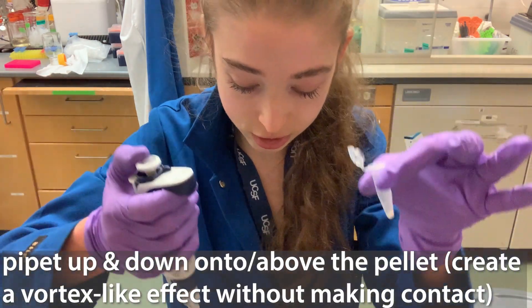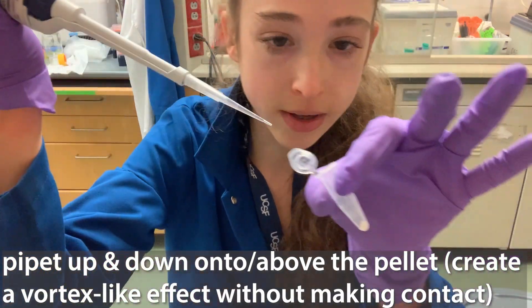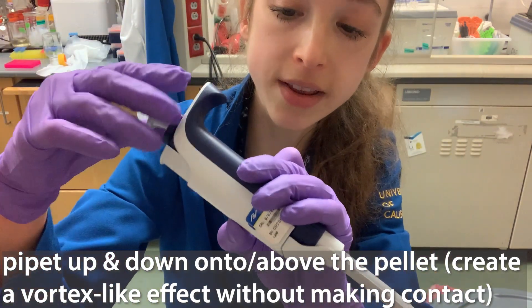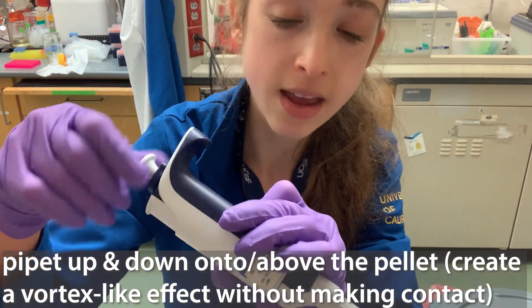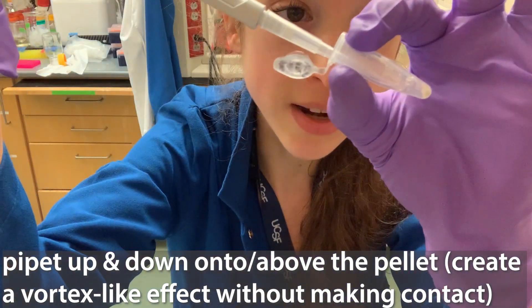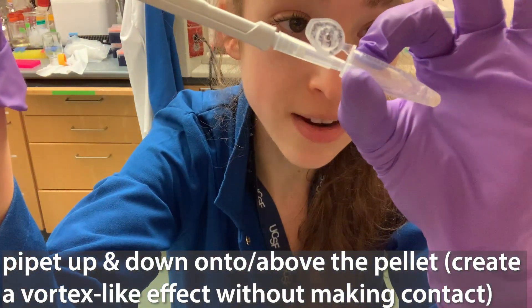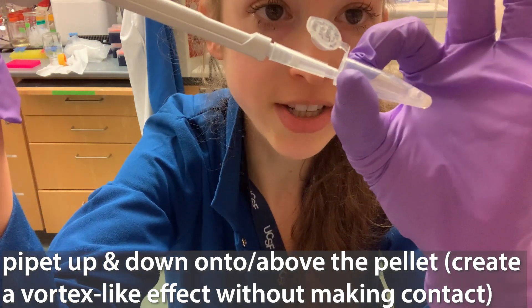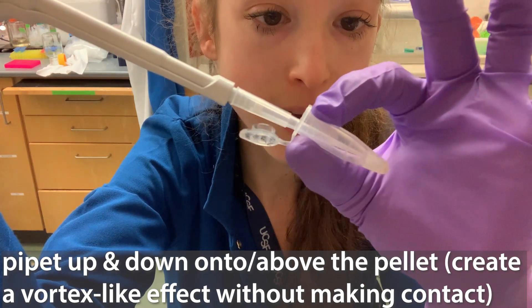Say you have a pellet in a tube. You add the liquid, the amount that you want. Now I'm going to set my pipette lower than the amount that I added. And now what I'm going to do is pipette up and down on top of the pellet. I'm not actually touching the pellet, so I don't get the pellet stuck on my tip.